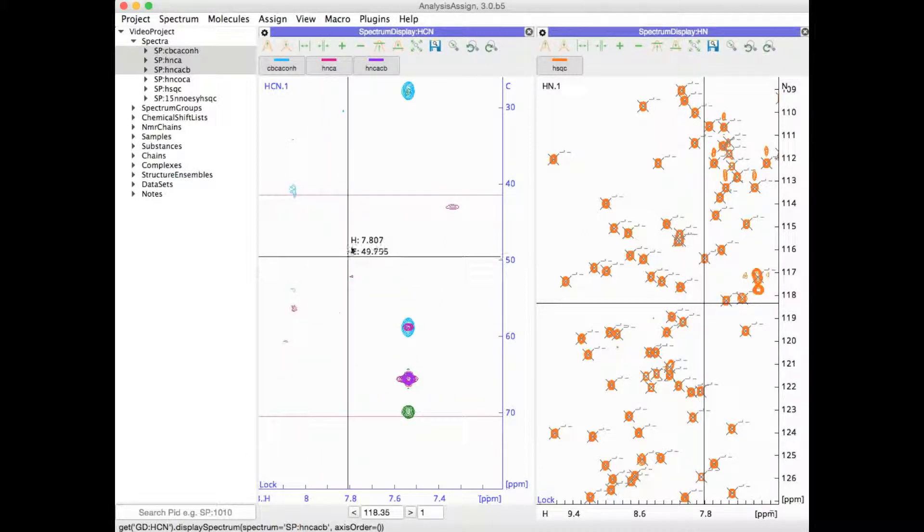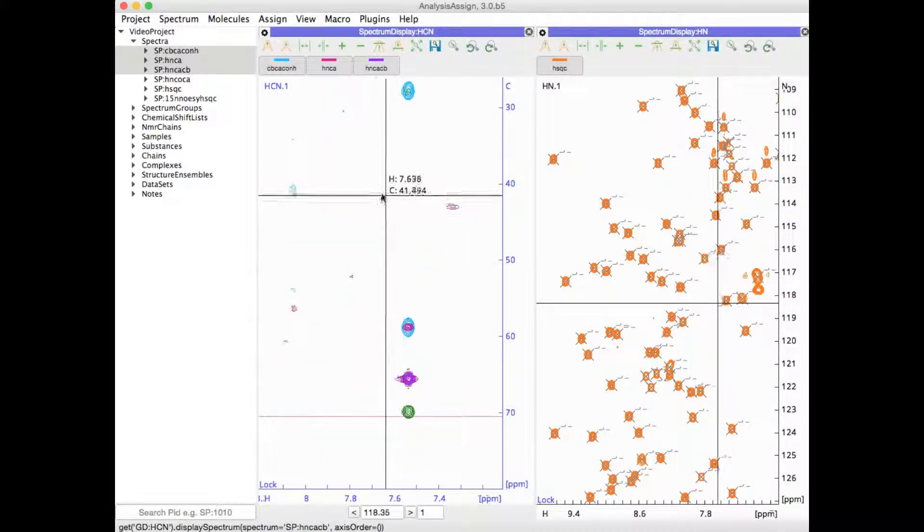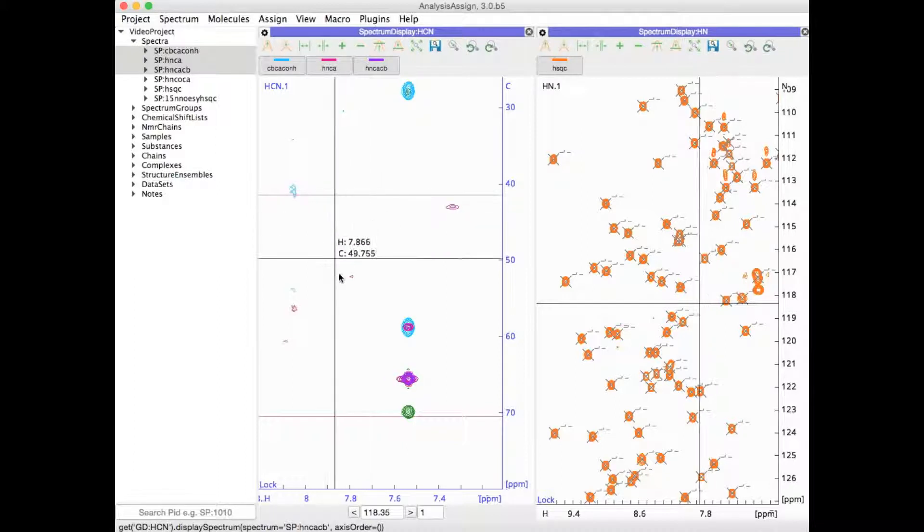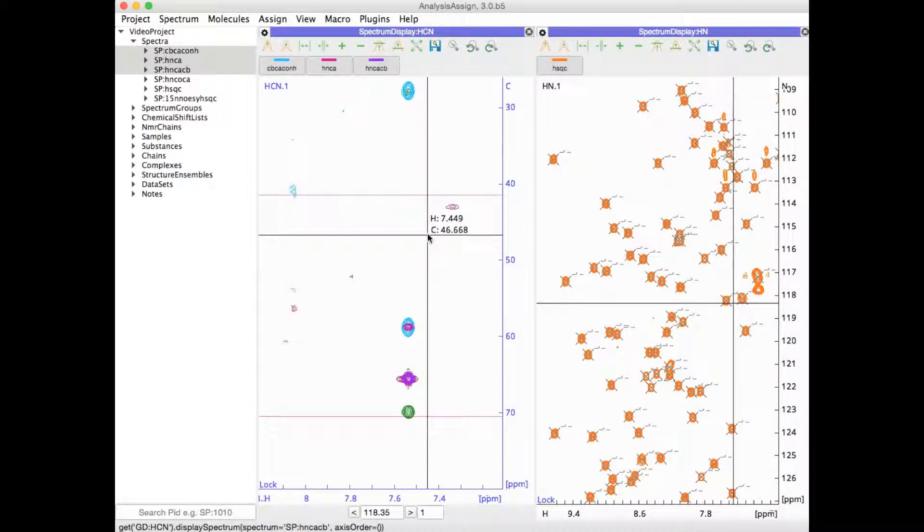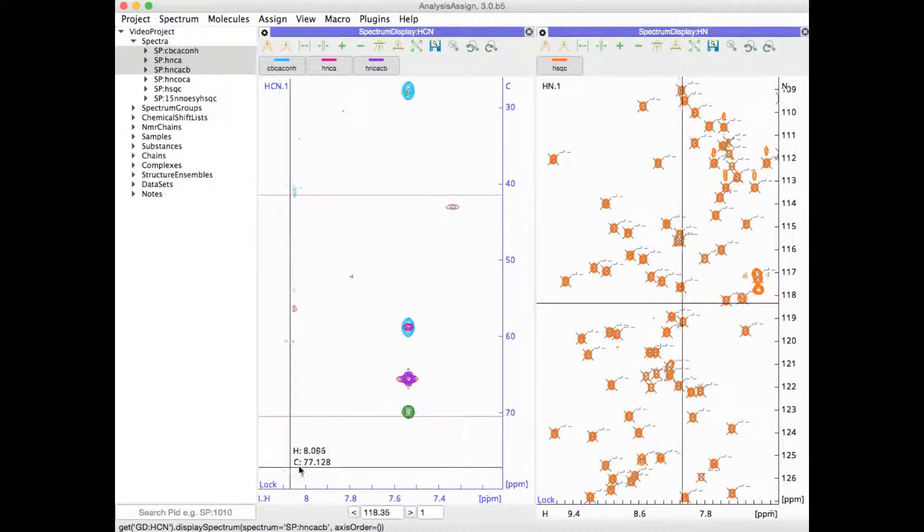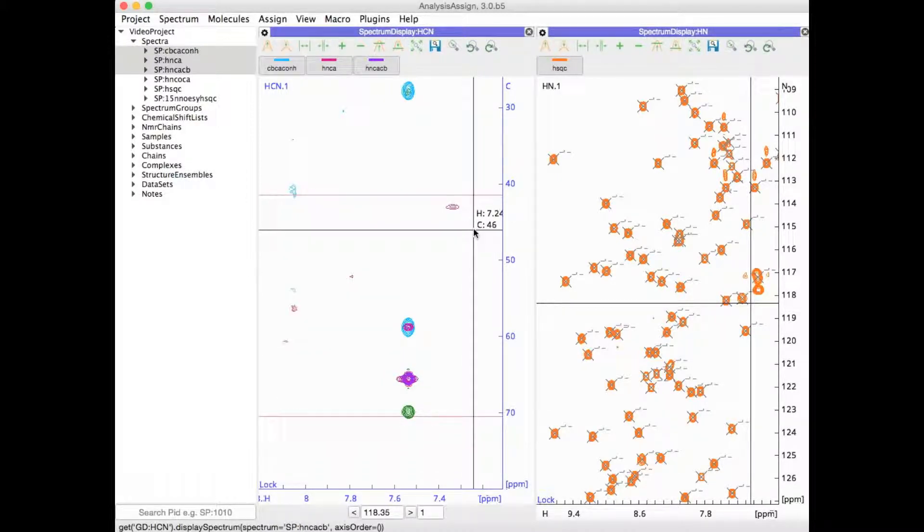Finally, if you would like to visualize your spectra in a different axis arrangement, you can very easily flip your spectra. At the moment, this display has protons along the x-axis, carbon along Y and nitrogen in Z.